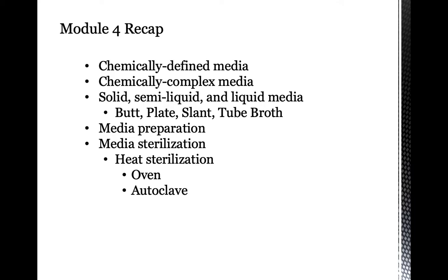While chemically complex media are those with ingredients that are not fully defined, which cannot fully be identified based on their contents. As an example, we have glucose minimal salt agar for chemically defined medium, and we have nutrient agar as an example for chemically complex medium.